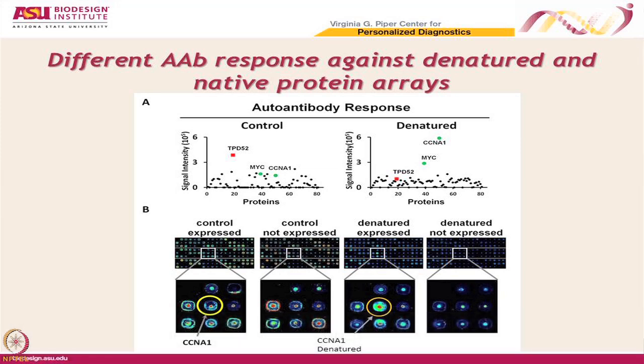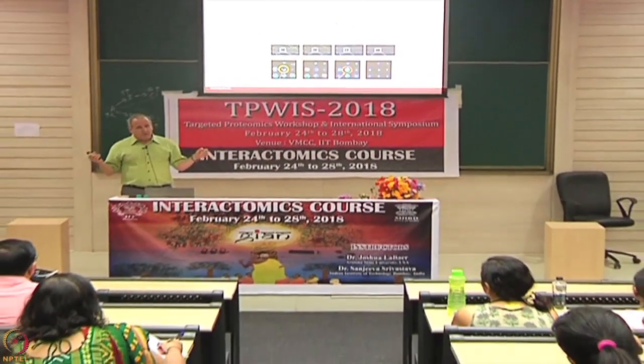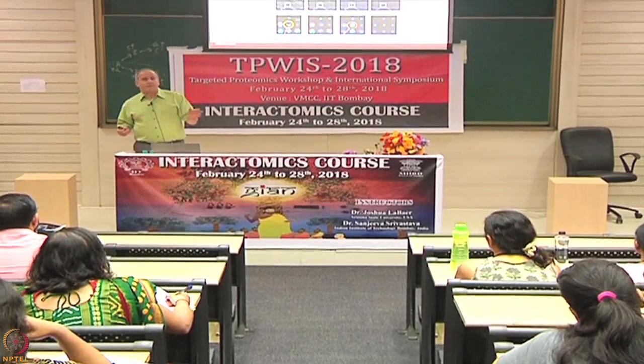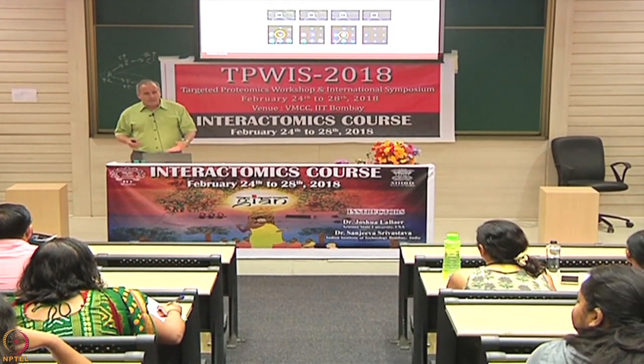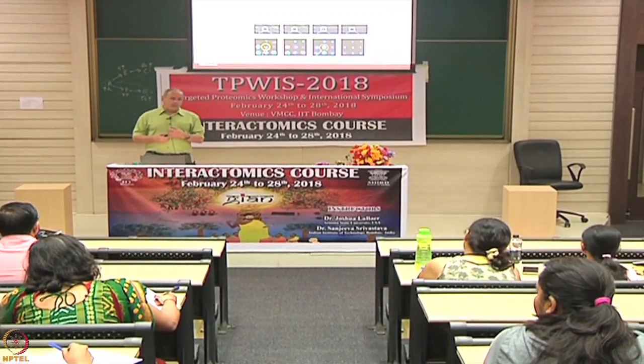No. The array was denatured. Then it was washed and then treated with physiological buffer. So the proteins were all stretched out on the array surface. You denature the array, then you rinse off the SDS, you rinse and you bring it back to room temperature, and now you add a folded antibody. Because if you denature the antibody, it wouldn't work. Or most antibodies don't work.